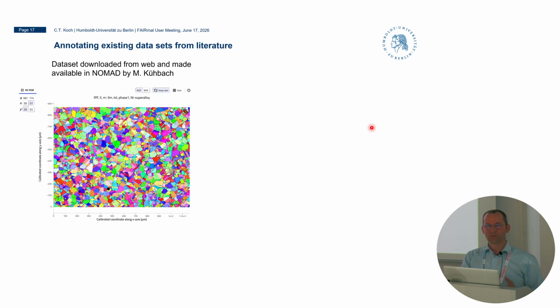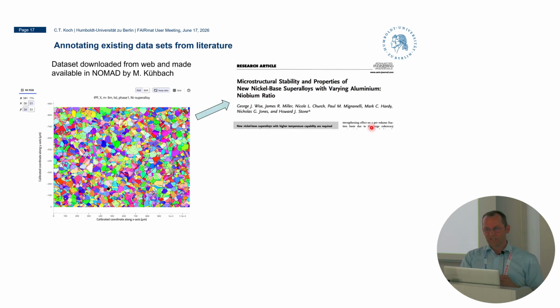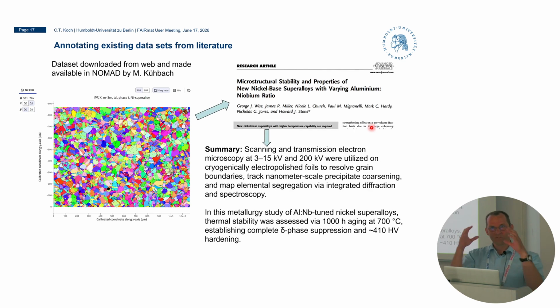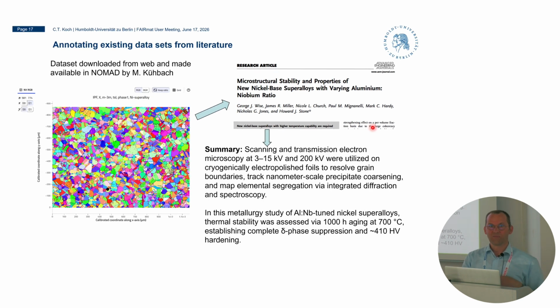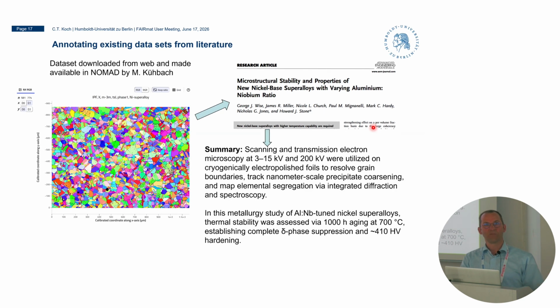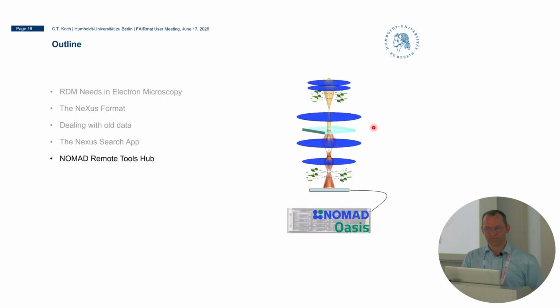And so we now have this workflow that extracts the paper, summarizes the paper, produces a short summary, and has a description that can then go with the data. And this really helps to auto-annotate our own data. So if the data looks similar to what we have, with all the metadata that we provide, this tool will, in the future, not yet, help to suggest annotations for our own data and make it easier for people to document their own data.